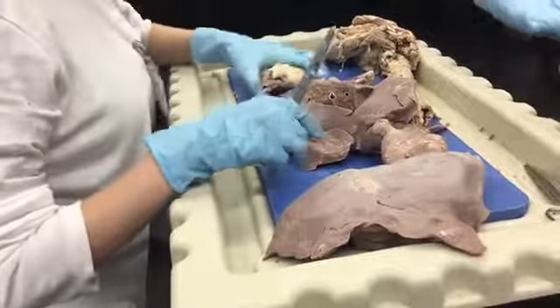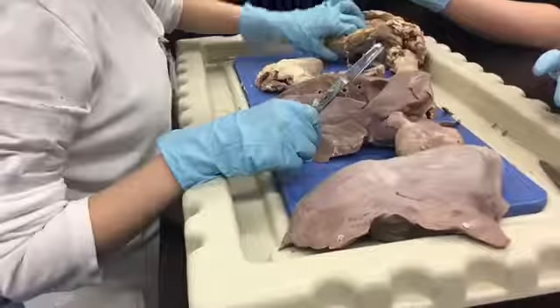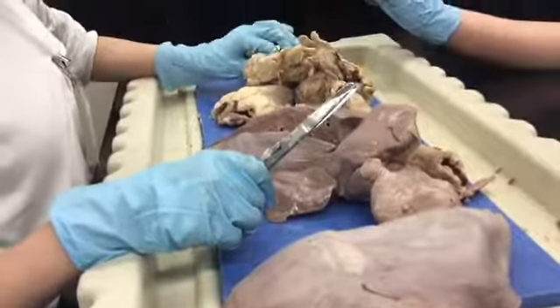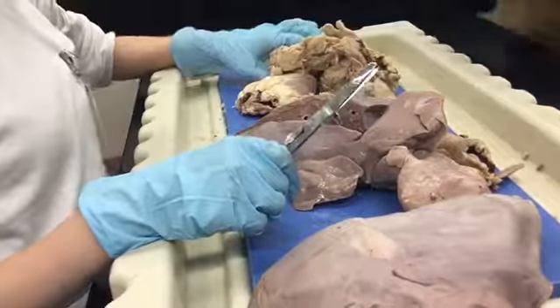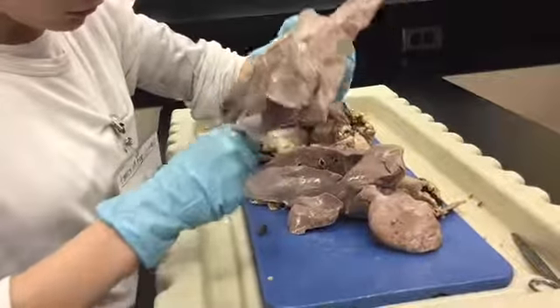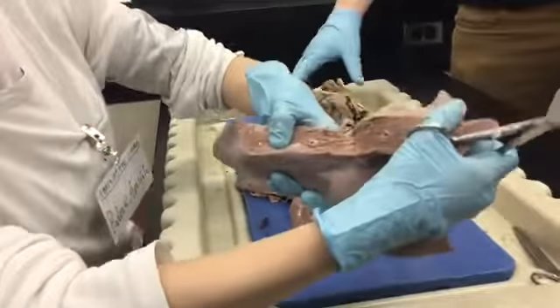Are you okay? This is the septum. Sheep, lung, heart. I think it was the heart on the table. And it's kind of collapsed. I picked it up, just a little bit. All right, let's throw out our dude. You're a good cameraman, I'll tell you that. There you go. See, look at that.